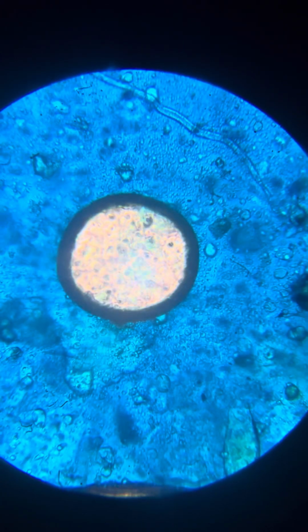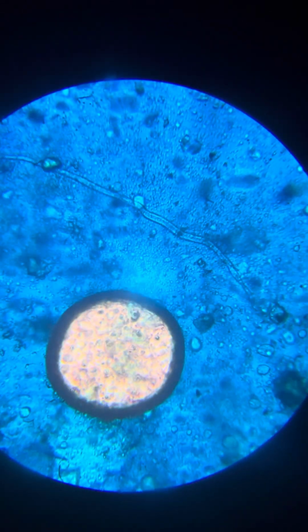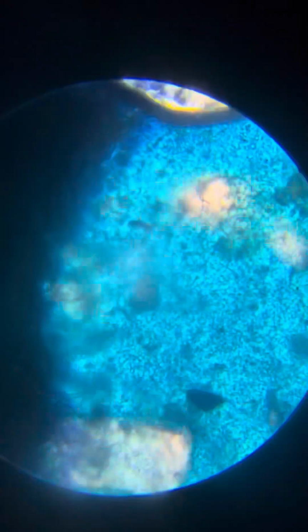Let's take a look. Very nice. And you see a zombified life form actually. This is a zombified life form. It looks like a fossil a little bit. So we see much more here, most probably because of the stain. Because we see much more than we've seen before, and this is from the same container. So yes, the blue color helps, without a doubt.